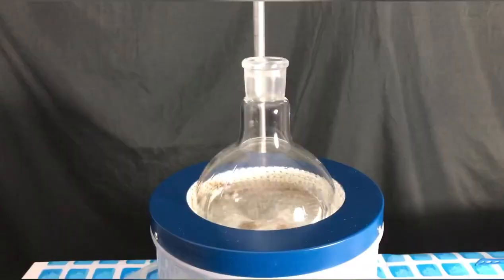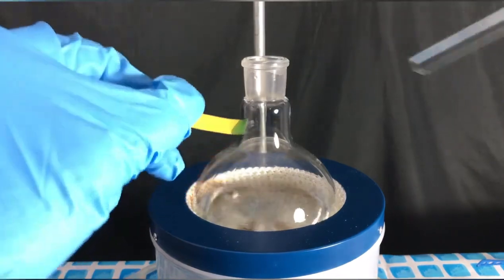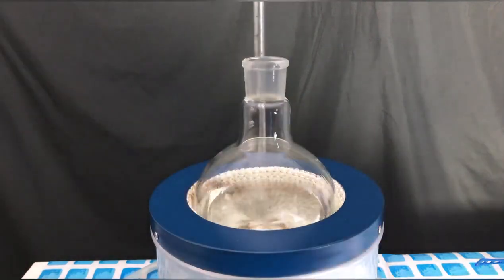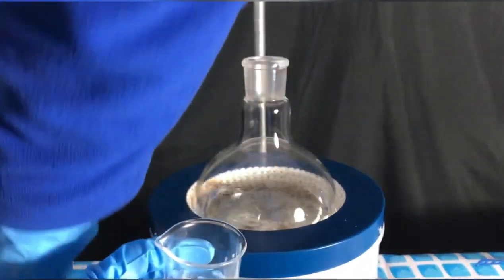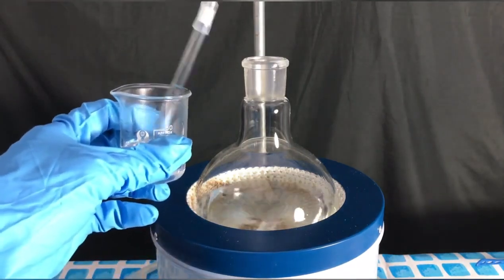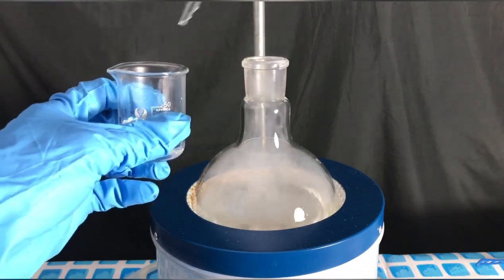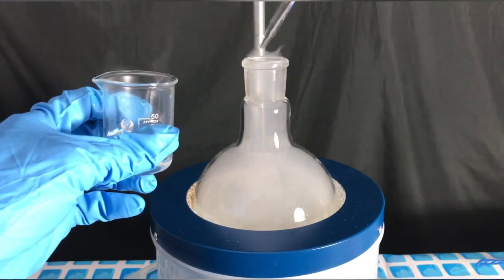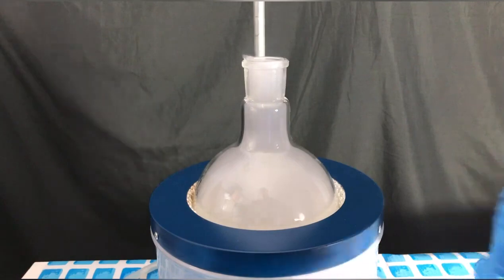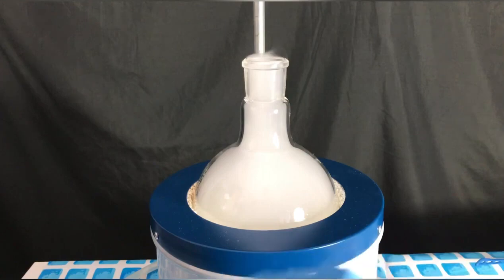Now the solution has to be acidified. The solution is basic because sodium methoxide will react with water to form sodium hydroxide. The sodium hydroxide will in return react with the barbituric acid, forming sodium barbiturate. Because we want barbituric acid, we have to add hydrochloric acid to turn the solution slightly acidic. Sodium hydroxide and sodium barbiturate will react with hydrochloric acid to form sodium chloride, and the sodium barbiturate will react with it to form barbituric acid.